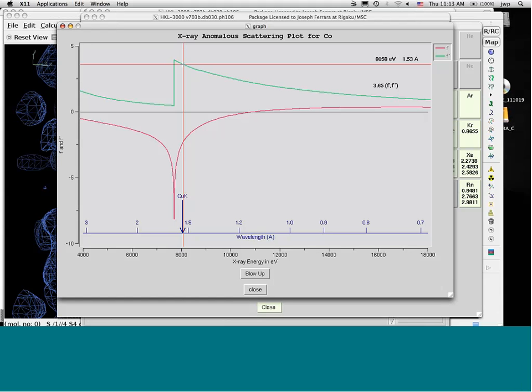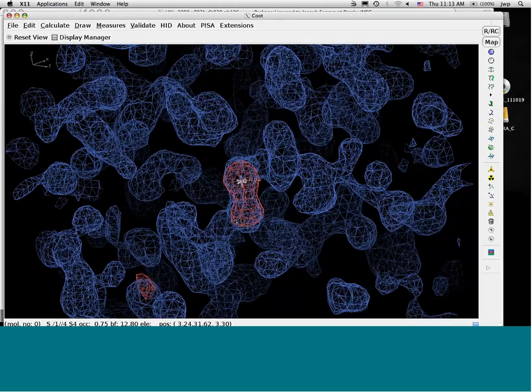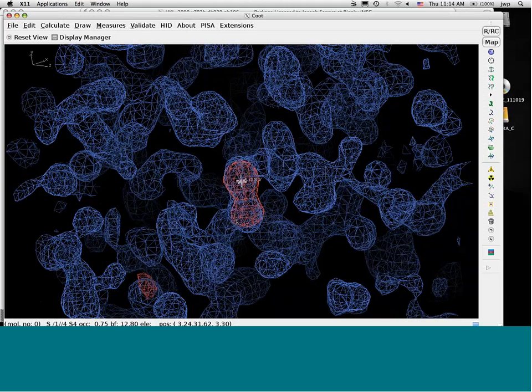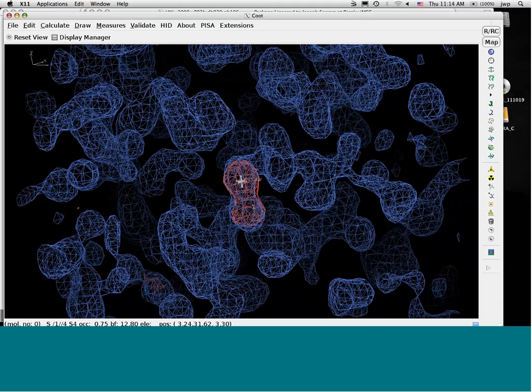Definitely. We have a question from Robert, and so I'm going to interpret. He's asking, why do we frequently see red density at the anomalous sites? Is that due to radiation damage? And I'm guessing he's talking about a difference map, or I'm not sure if he's talking about this, and that's just a coloring scheme. Yeah, so this is just a coloring, and so the resonance scattering of the electrons in here give rise to a signal that we're using to do the phasing.